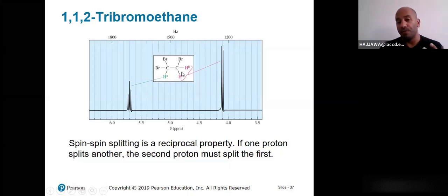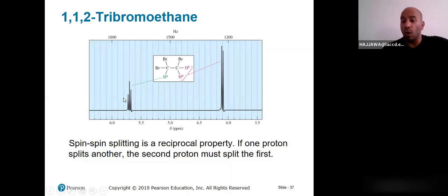The third, the intensity. The intensity should also be an indicator to be used. So I have the height of the CH2 peak double the height of the CH. And the last thing is the signal splitting. The signal splitting of the hydrogen that's HA will be N plus 1, where N is the 2 hydrogens on the adjacent carbon, plus 1 that will be a triplet. The triplet is usually drawn in a way that's 1 to 2 to 1. So that's how we draw a triplet.